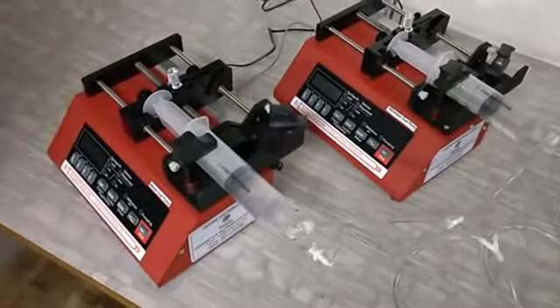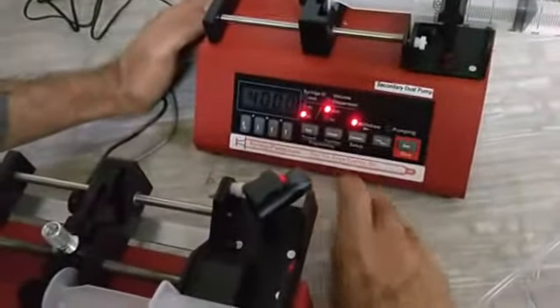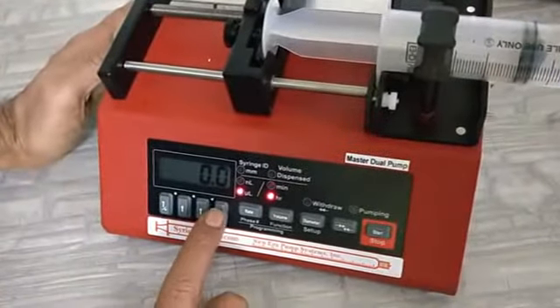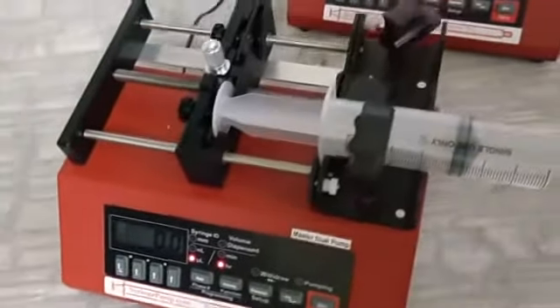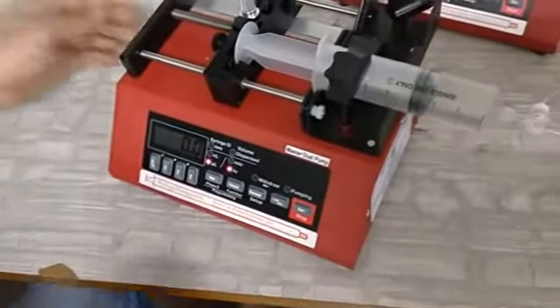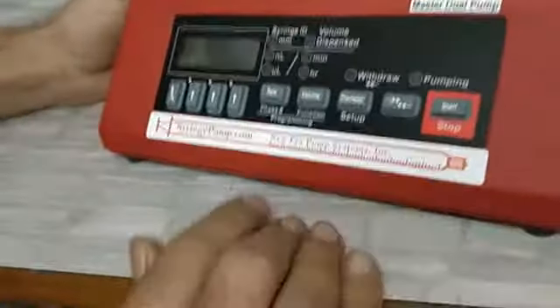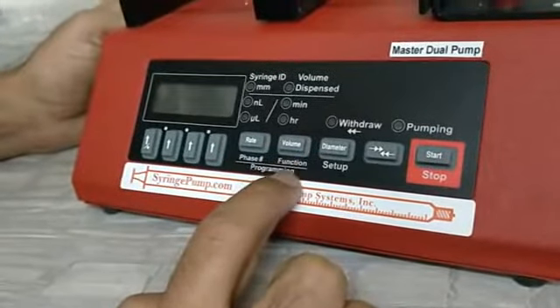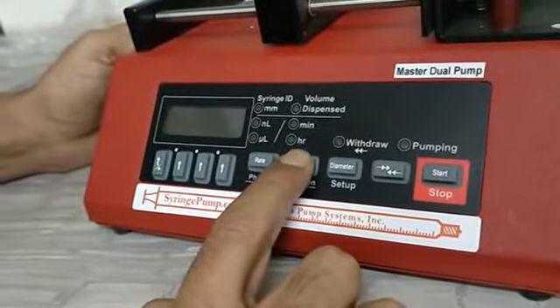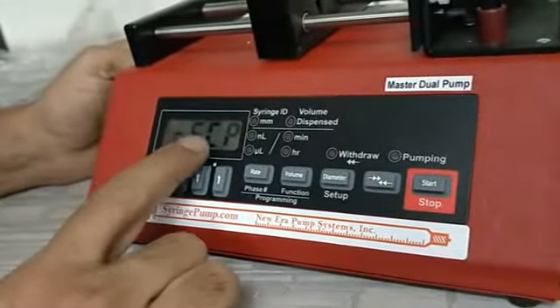The next step is to supply power. First, give power to the slave pump — it will flash; press any arrow key and the flash will stop. Now give power to the master pump — it flashes; press any key and it stops. To run the pump in dual mode, the operation is slightly different. Switch the master pump off, then press and hold the volume or function key. While holding it, switch the power on. It will display continuity mode — press the left arrow key and it comes to reciprocal mode. You must put the master pump in reciprocal mode to run the two pumps in dual mode.